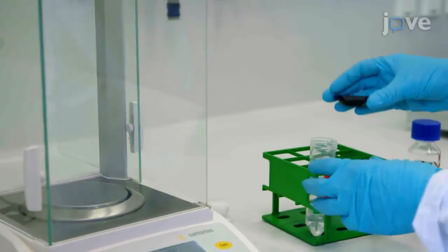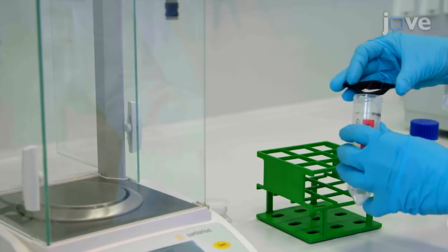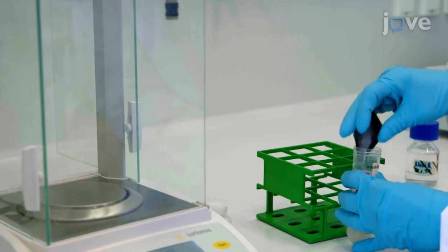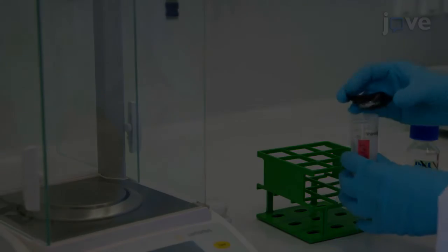To prepare the 100 millimolar unnatural amino acid stock, add 206.2 milligrams of unnatural amino acid to 8 milliliters of ultra-pure water. Raise the pH.